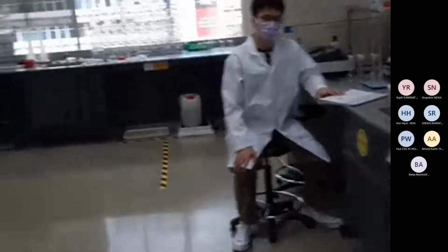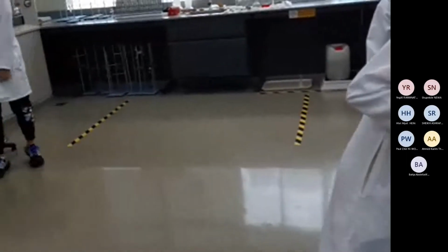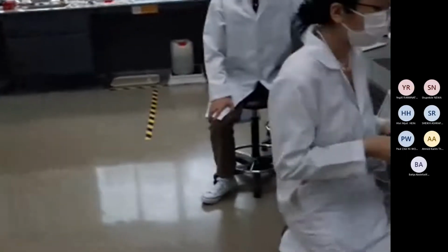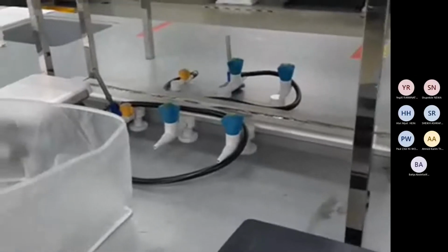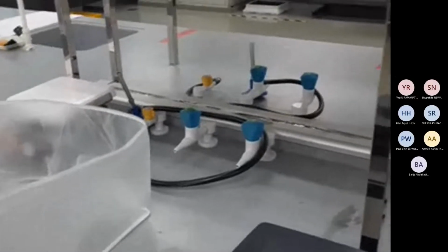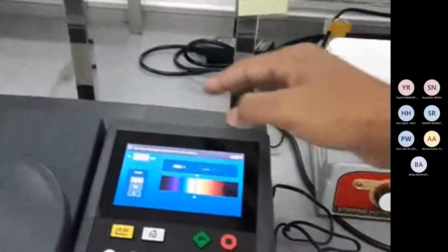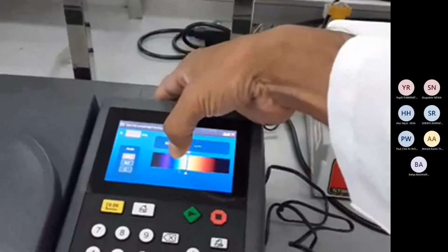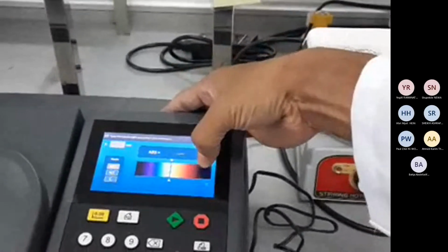Can I have some space here? I want to show this thing. Everyone has the spectrometer, so we'll be using it. This spectrometer, everything is set, right? You can visually set the color. This is the ultraviolet region. This is the red, and then it's going.